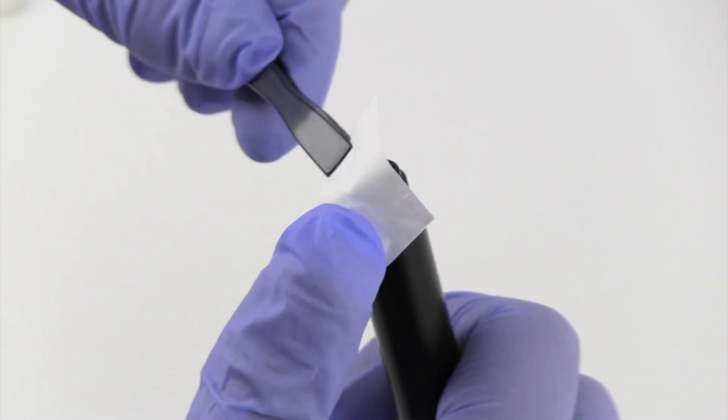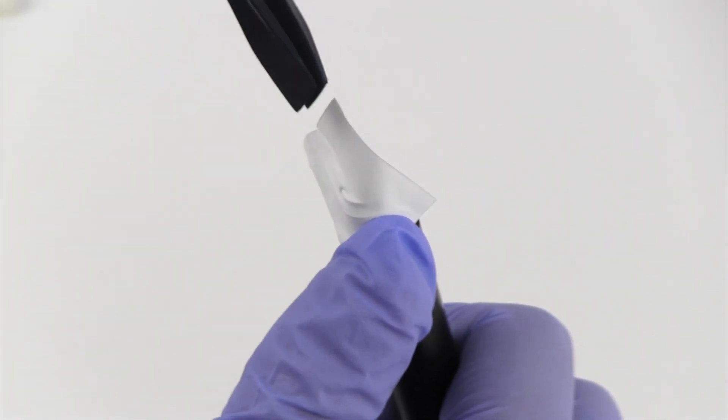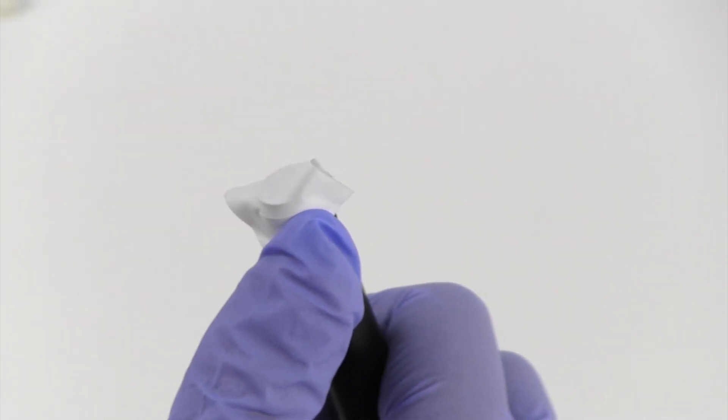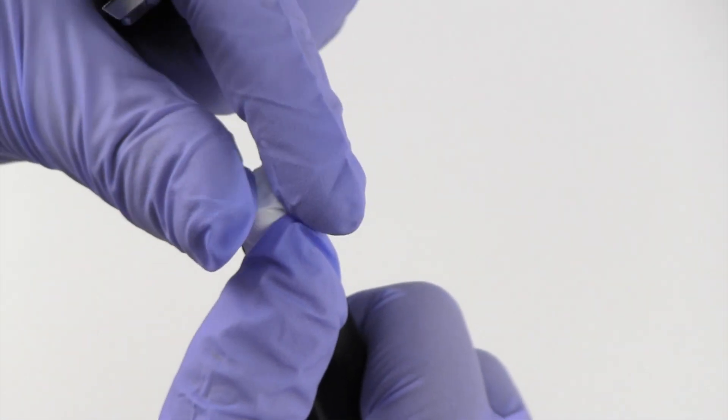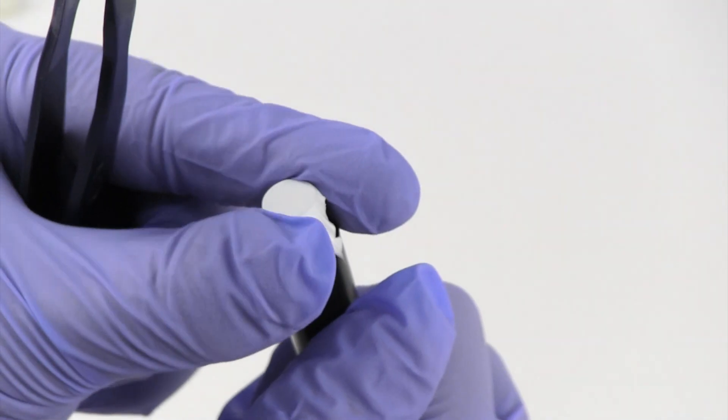Lay the membrane down on the end of the outer probe body. Using your thumb, hold one corner against the threads and with the tweezers, gently stretch the membrane over the end of the outer probe body.